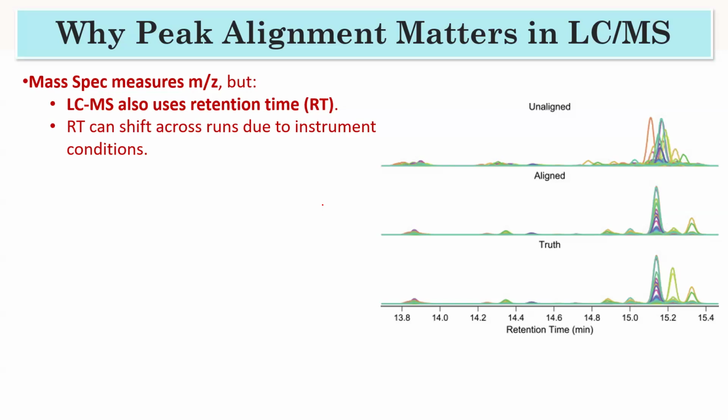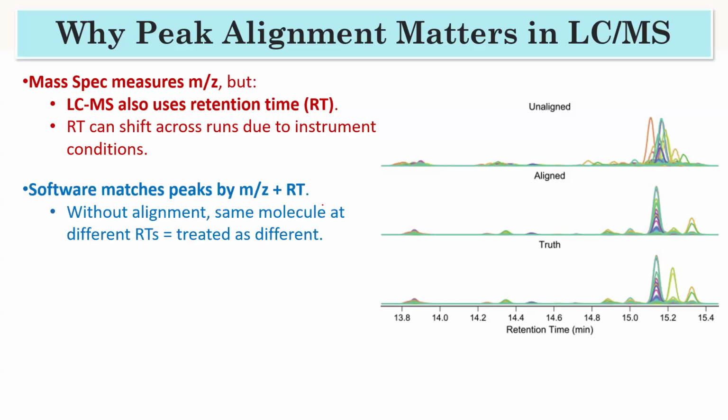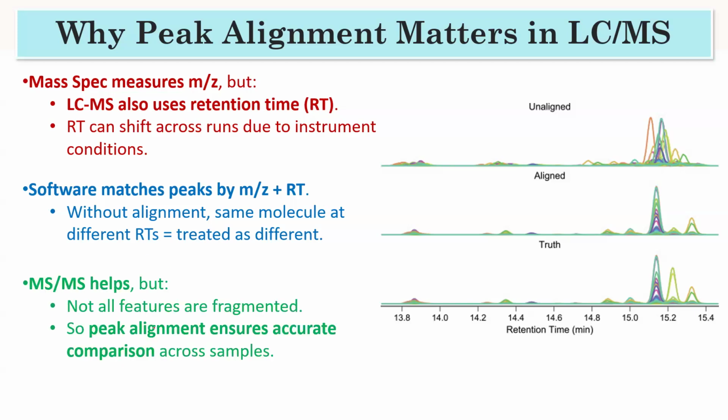We can use matching by m/z and also retention time. It will help you in getting better resolution for your molecule. So I just wanted to tell you that if you use LCMS, you may get some peak alignment differences, so you have to use some software to align them and then analyze.